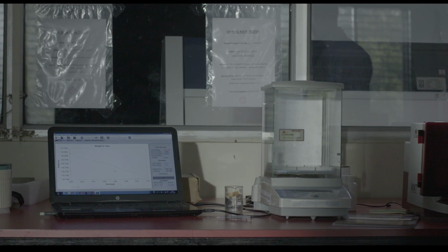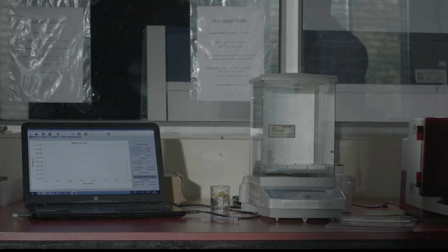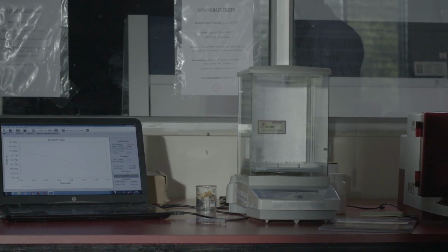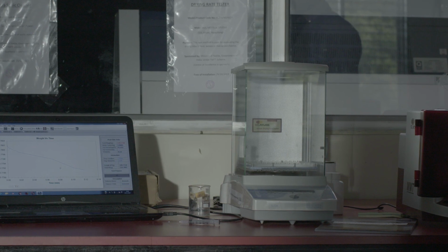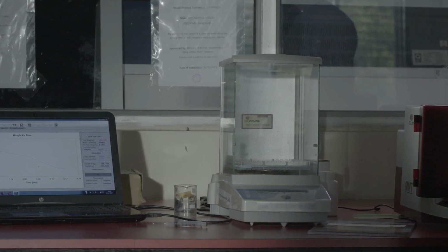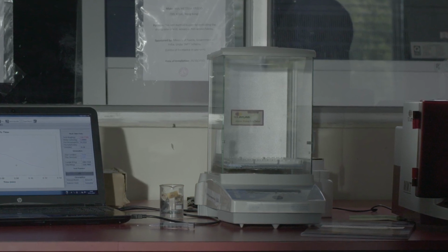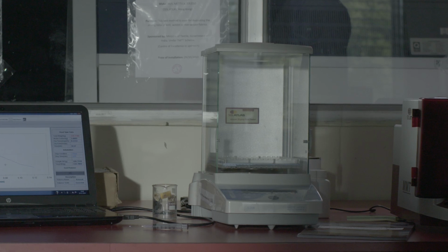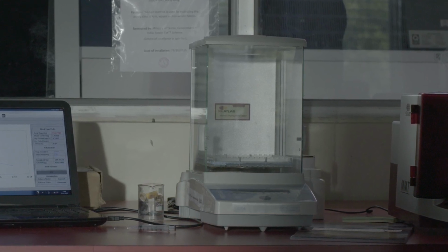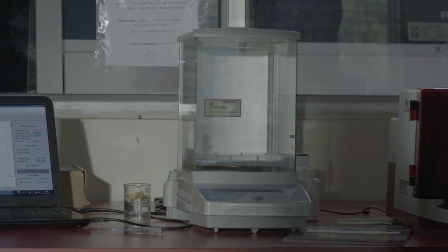This drying rate instrument determines the drying rate of textile fabrics based on the evaporation rate at standard atmospheric conditions. Measurement of drying rate has become one of the important tests for studying the performance of moisture management fabrics which are used in sportswear. This testing is based on measuring the weight of water content which is applied on the fabric for a particular time period by using a weighing balance and with drying rate software connected to it.